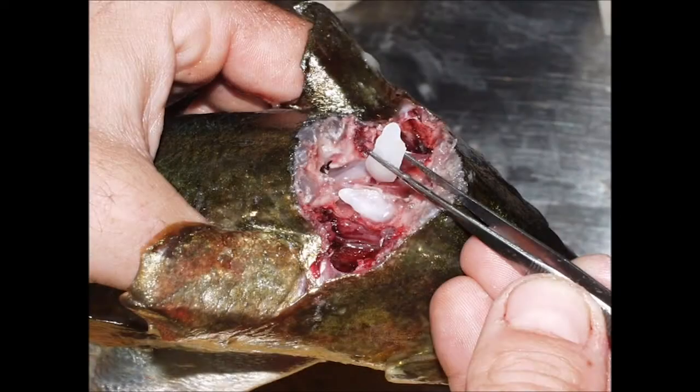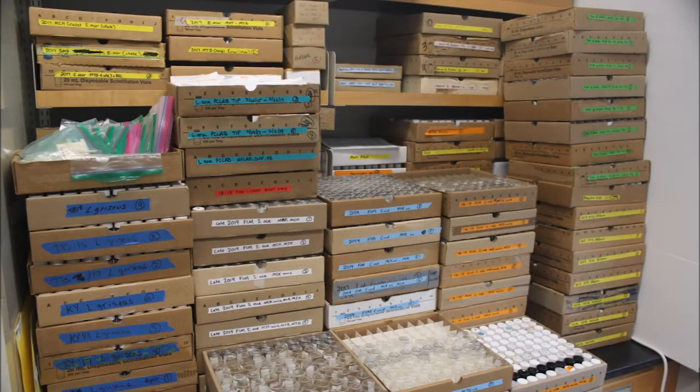The first step is extracting the otoliths from the head of the fish. The otoliths are then cleaned, dried, stored, and sent to our lab. We have Kristin Cook and Kristin Reinersen here today to walk you through the science of processing and aging otoliths.